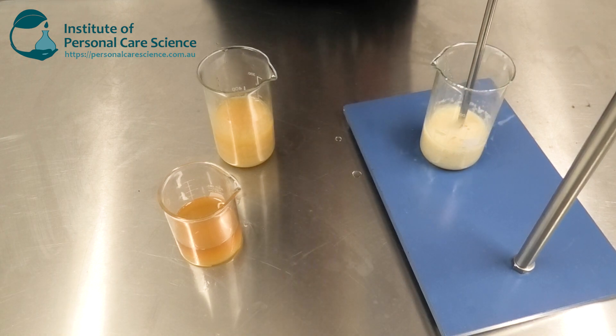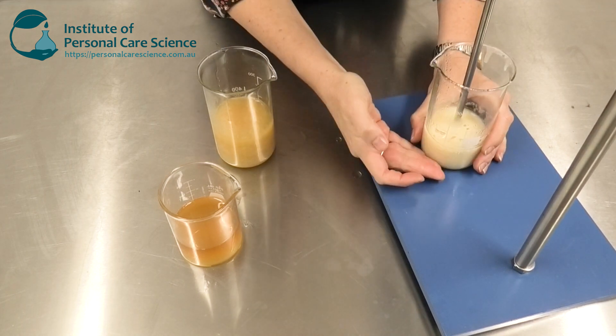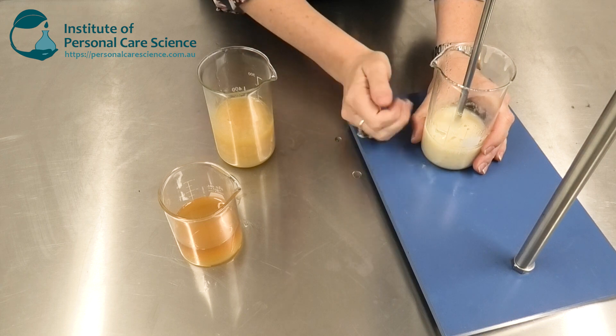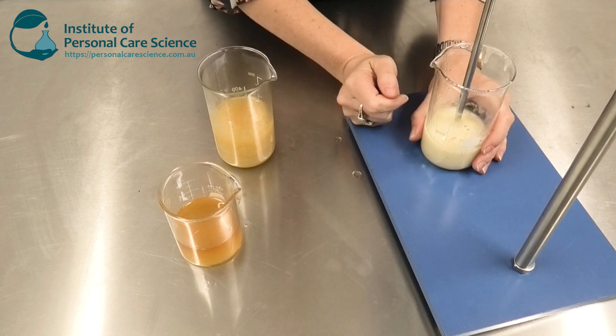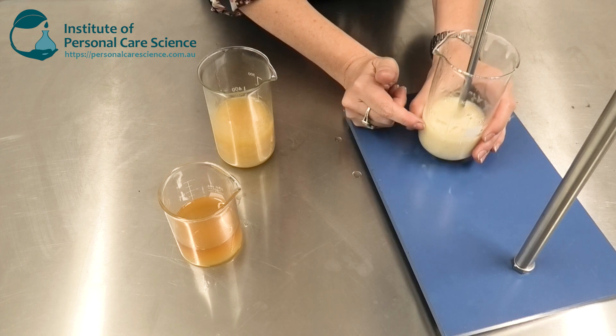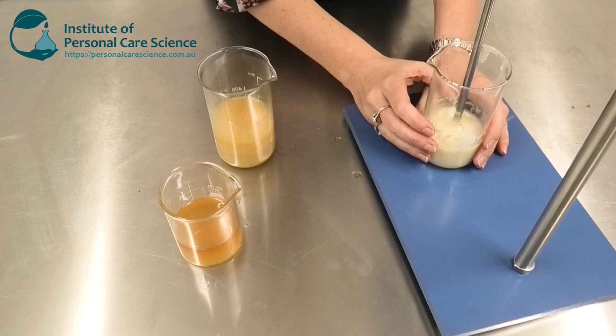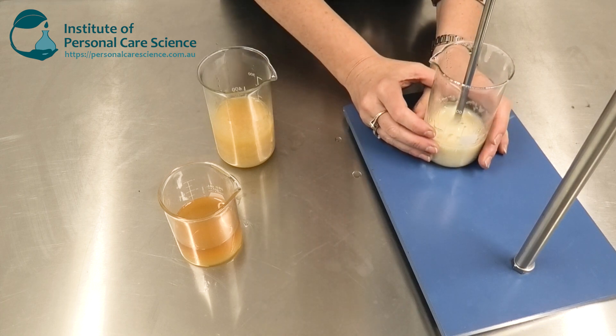It's really forming that starting structure that matters most to getting your sucragel product right. Another thing you need to do — especially in the lab, not so much in a large batch — is as you start to get more product in your beaker, you need to adjust the height of that propeller stirrer so that you're mixing the entire product effectively. Otherwise you just don't form that honeycomb structure to support the very high internal phase.